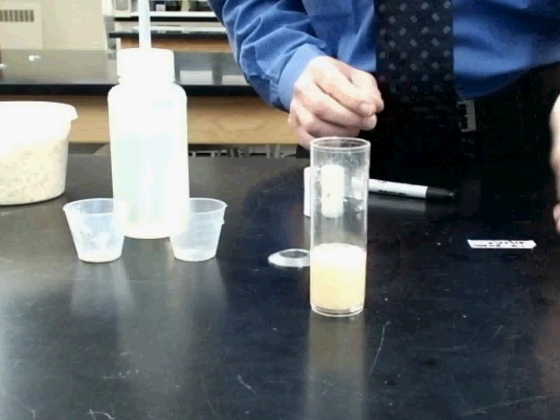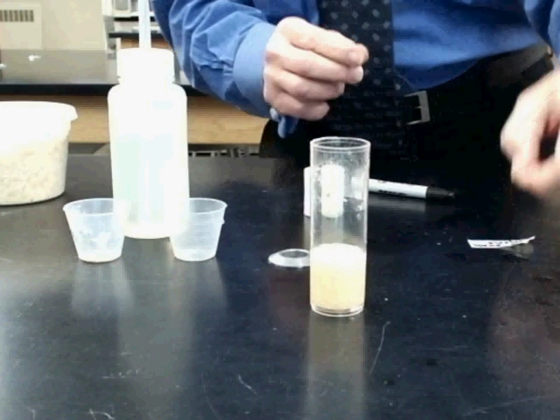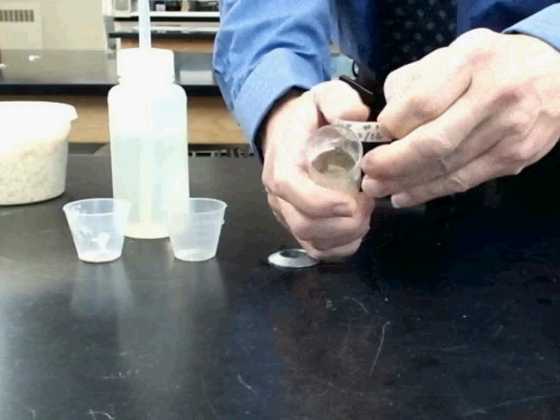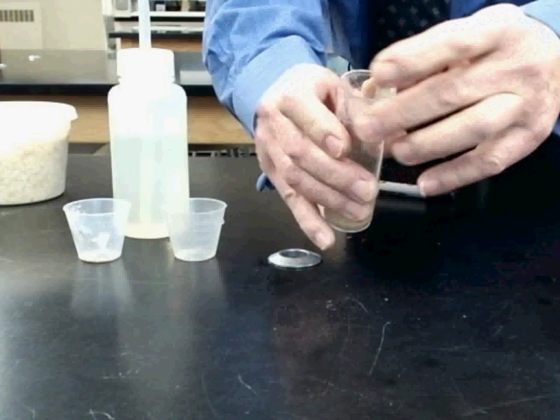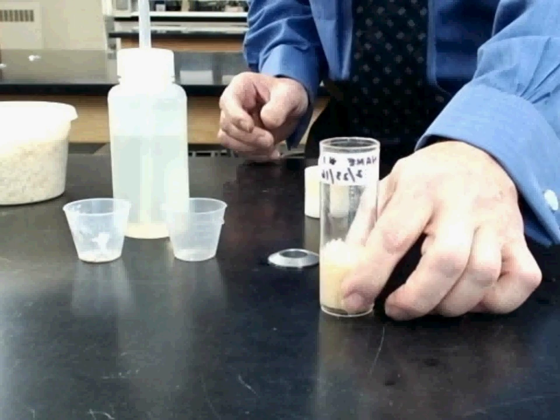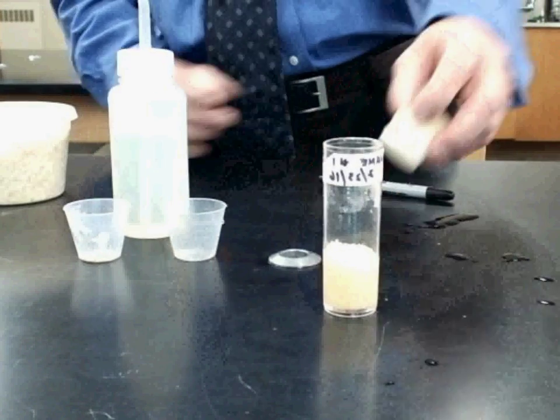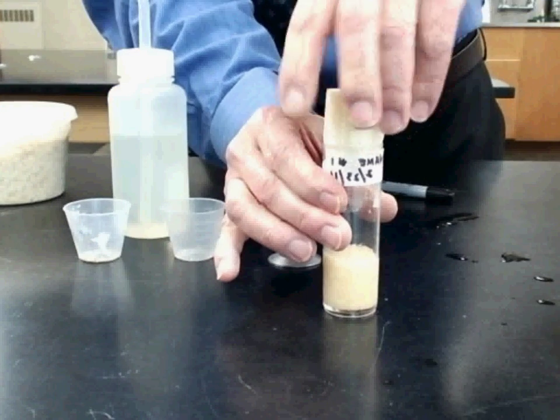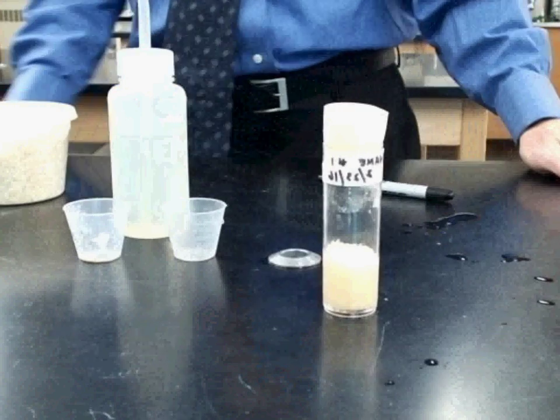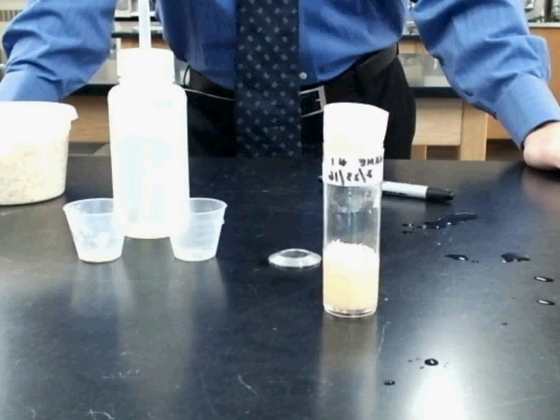And I'll place that at the top of the culture vial. My name, culture number one, and the date. And the sponge top then goes right there. And we're ready to inoculate.